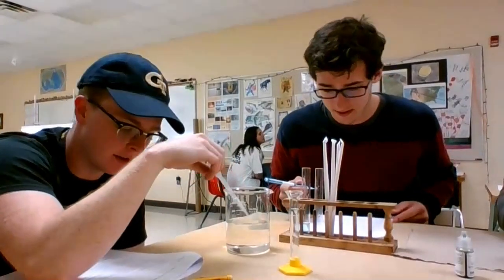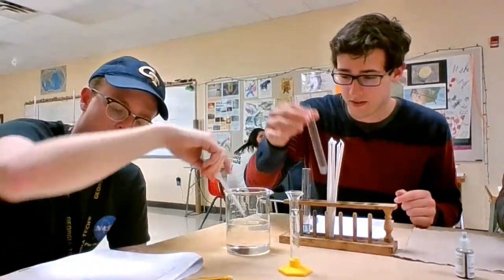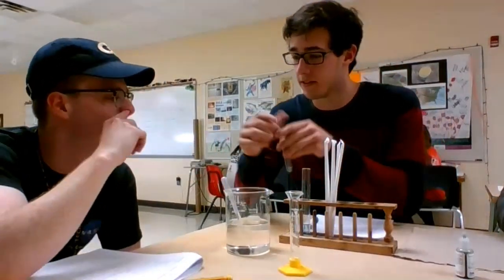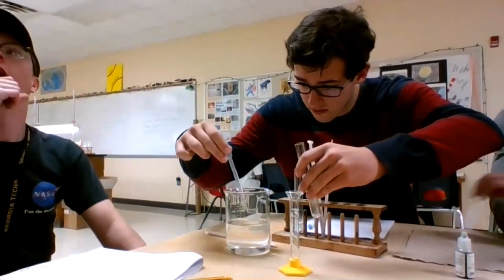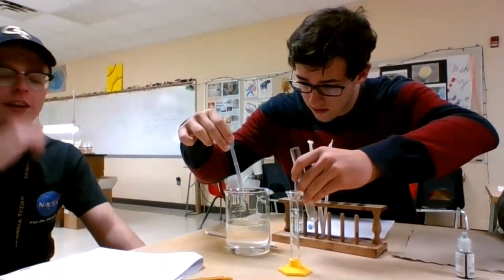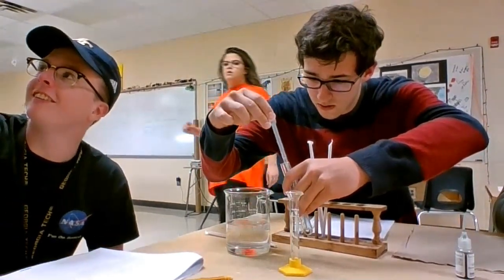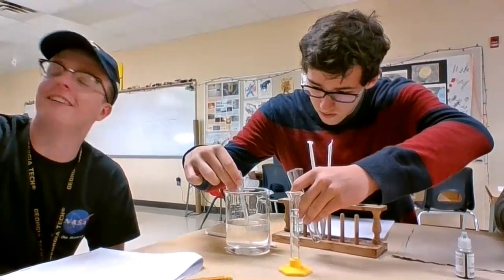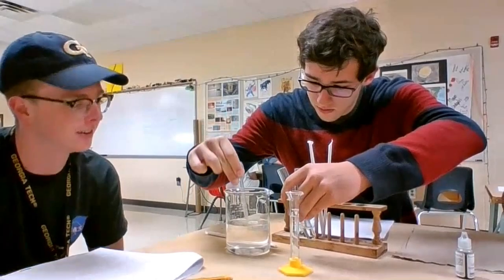Now, pipette 5 milliliters of water into the second test tube. Exhale gently through a straw into the water for 30 seconds. After we get 5 milliliters. Okay. I want to blow in it. No, just do it in general. Let's go. 30 seconds. Do it like that, 3 times for 10. Yeah, like that. Which one are we on? Hit it some more.